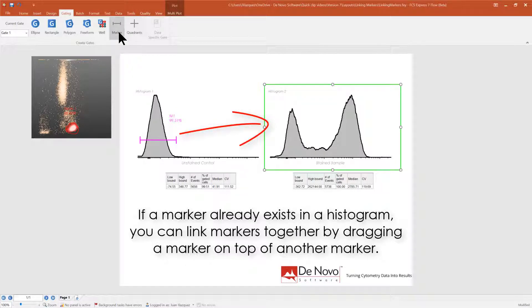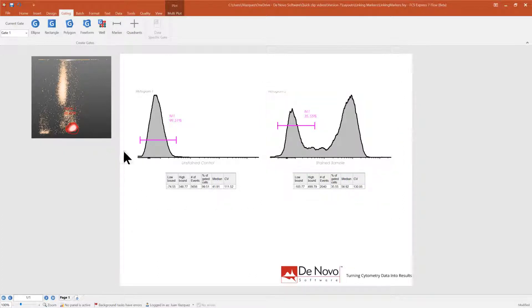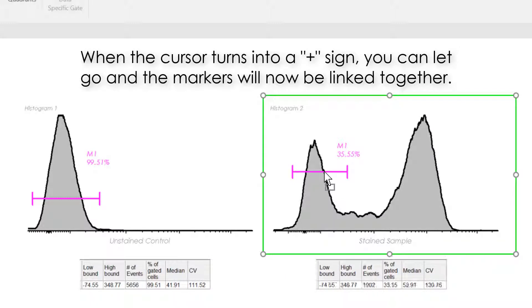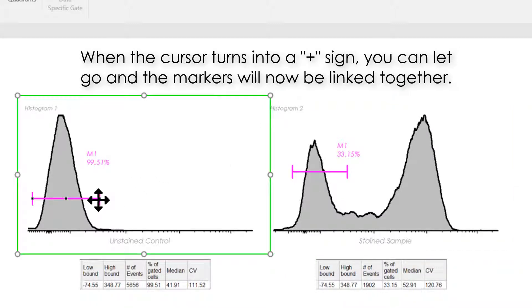If a marker already exists in a histogram, you can link markers together by dragging a marker on top of another marker. When the cursor turns into a plus sign, you can let go, and the markers will now be linked together.